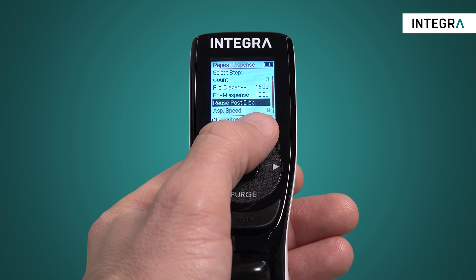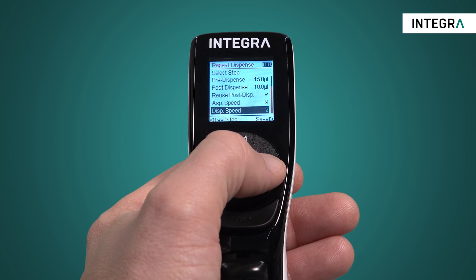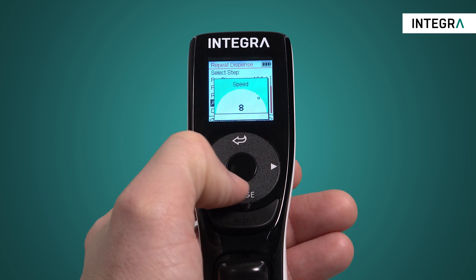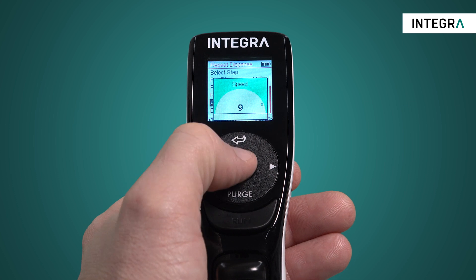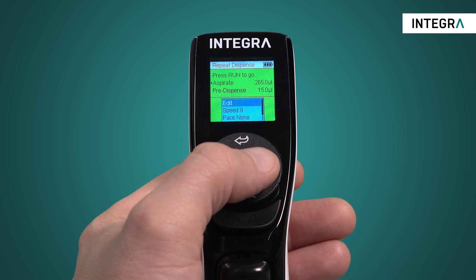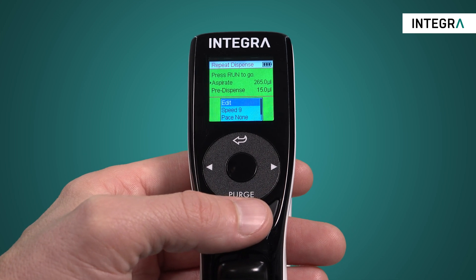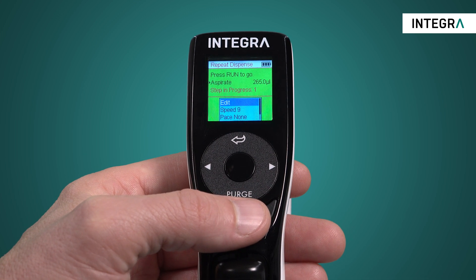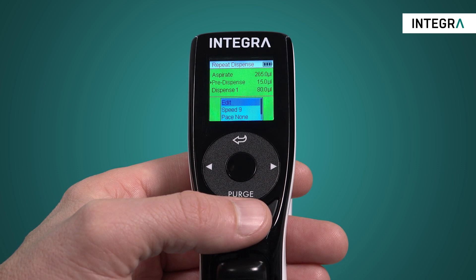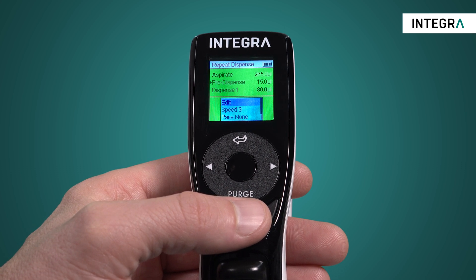How fast or slow you pipette is also controlled here. Aspiration speed and dispense speed can be independently programmed. When you're ready, you simply go back to the run screen and start by pressing the run button. A very useful aspect of these pipettes is that the screen always shows exactly what step will be performed when run is pressed, and also what's happened and what's coming next.